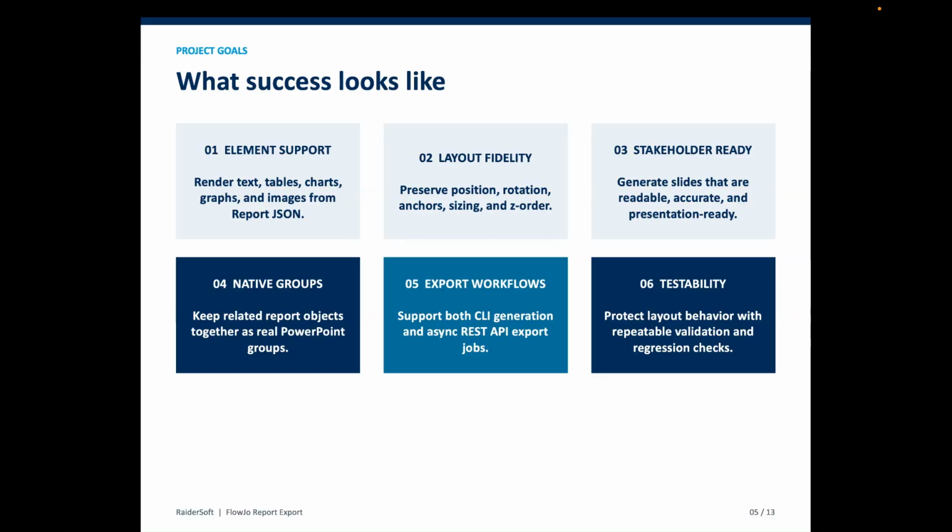The biggest technical goal was native grouping. Related report objects like a graph and its labels should stay together as a real PowerPoint group instead of becoming a bunch of disconnected shapes.